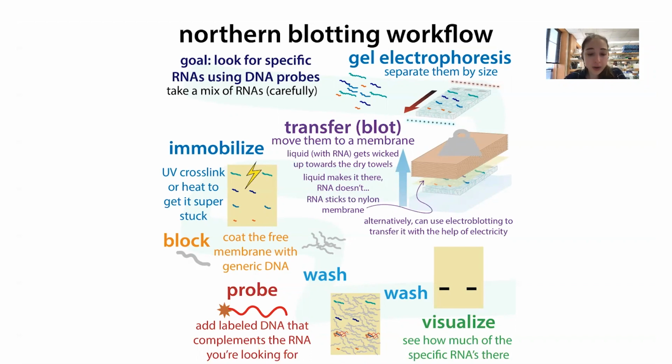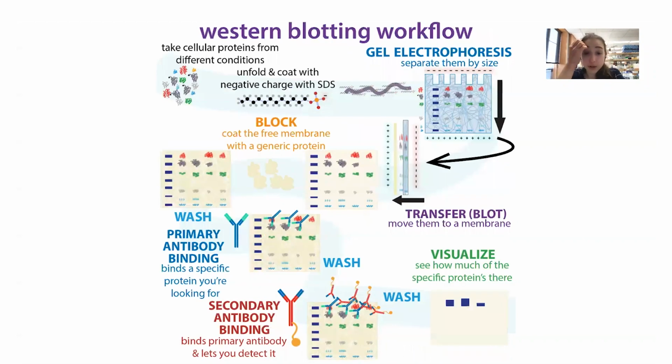And then what we're going to do in any of these methods is we're going to wash. We need to wash off any of the unbound blocking agents. So we've prepared our molecules, we have separated them, we've transferred them, we've blocked.